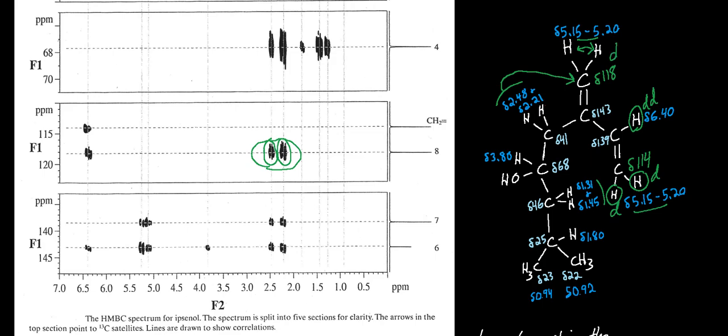So we have some kind of signal at the top that's all of these overlapped. Perhaps a doublet of doublets, another doublet, and another doublet with a different magnitude of splitting. I should probably fix that. So like a narrower and a wider split where we have these as trans and cis. Little tip there: trans alkene protons have broader or stronger coupling.